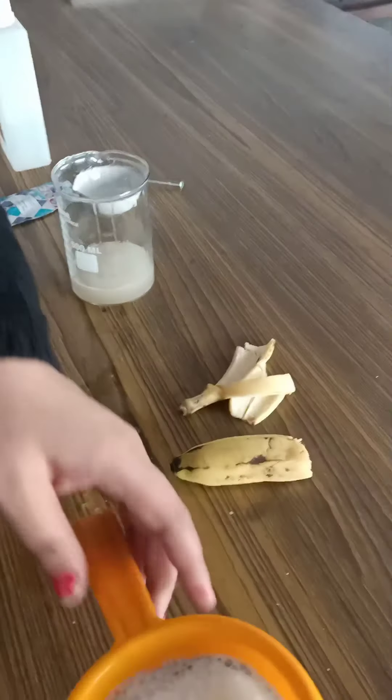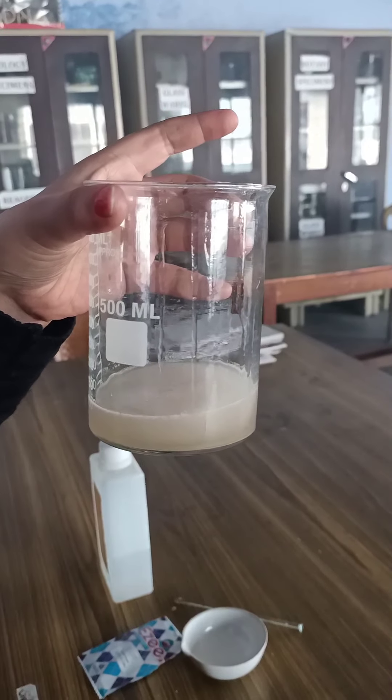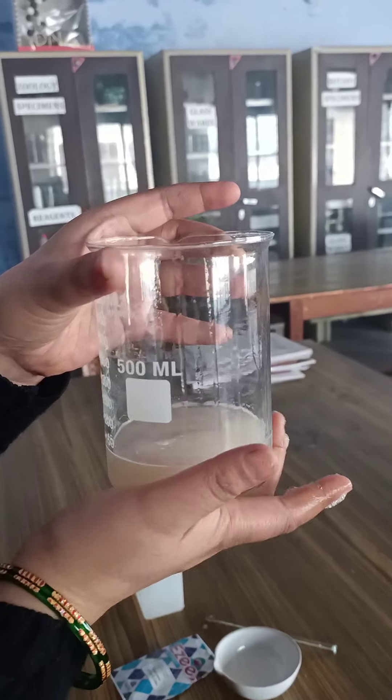Take the strainer and place it on the beaker. Start pouring the mashed banana along with the solution onto the strainer. The solution will be strained into the beaker. You can use your fingers to press through so that the cells of the banana are strained into the beaker. The raw fibrous part of the banana will be left on the strainer — set that aside.